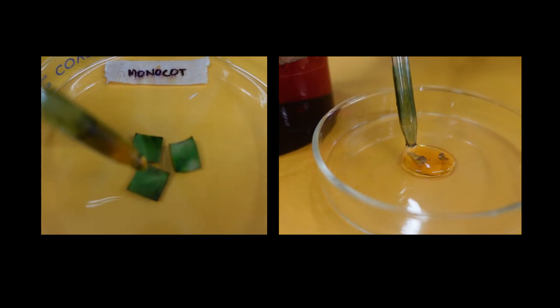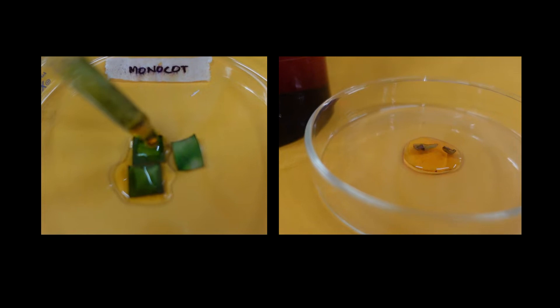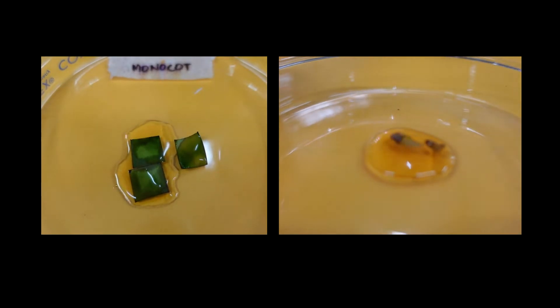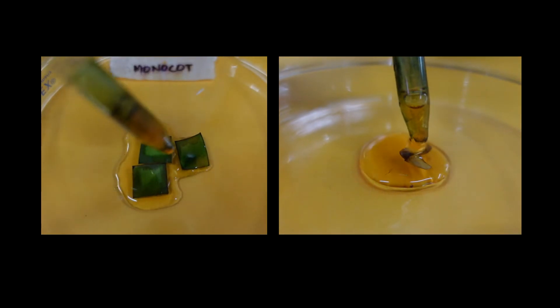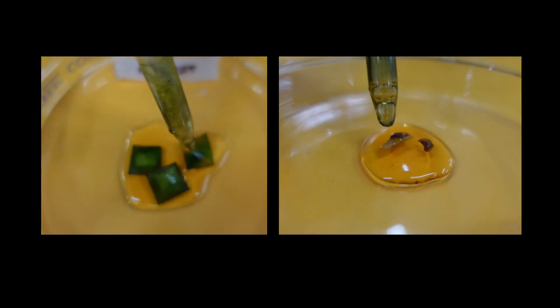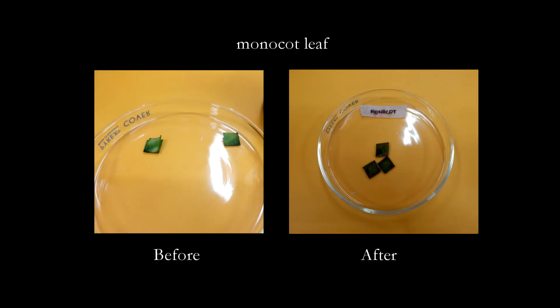Take the leaves and allow them to cool on a watch glass. Then bathe them in iodine solution. Finally, remove the excess iodine solution and record your observations.